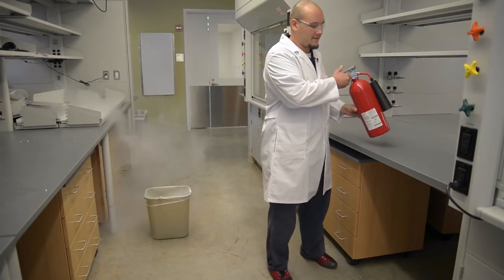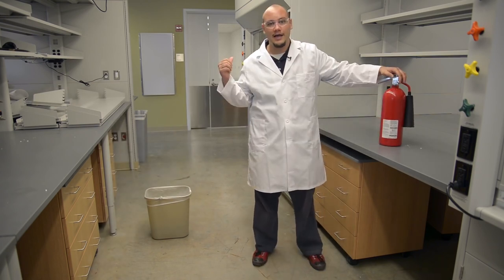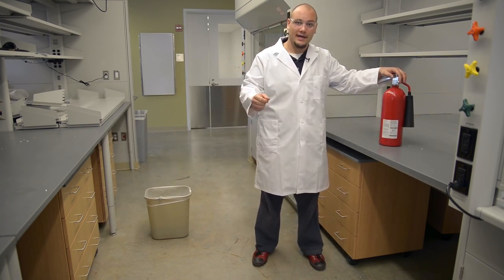Make sure to discharge the entire fire extinguisher before leaving the lab, closing the door, and activating the nearest pull station.